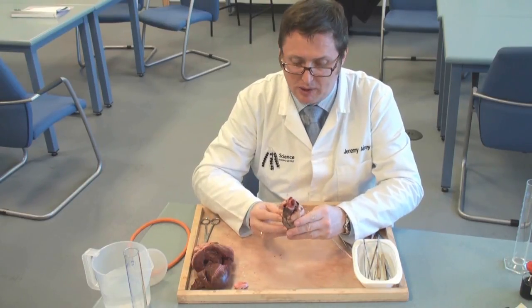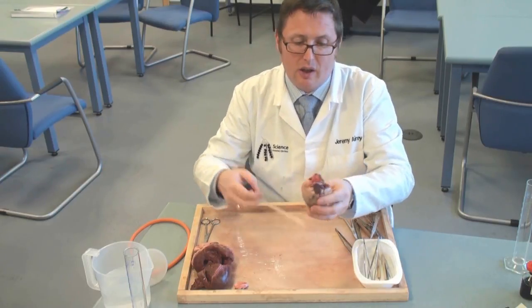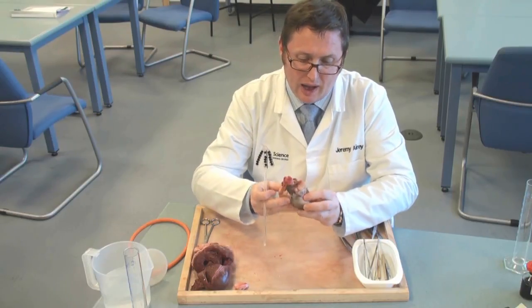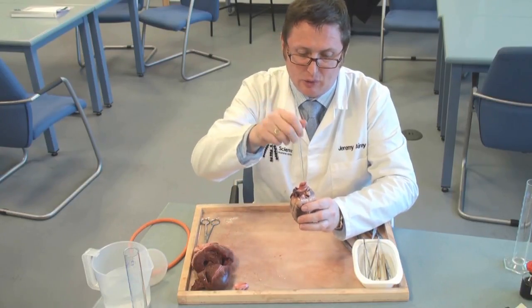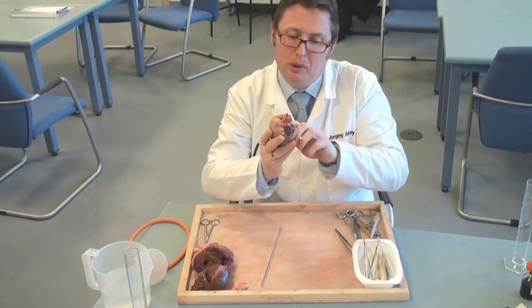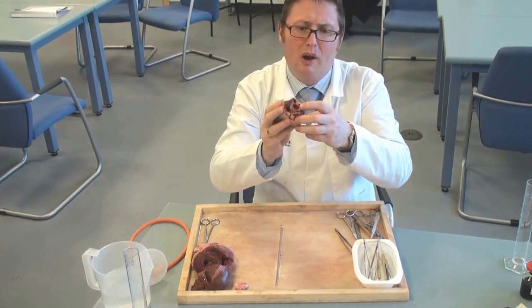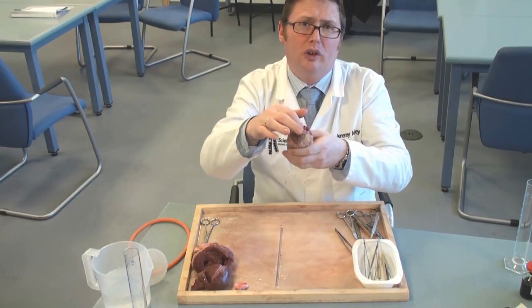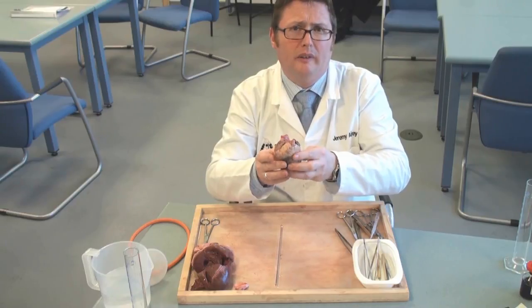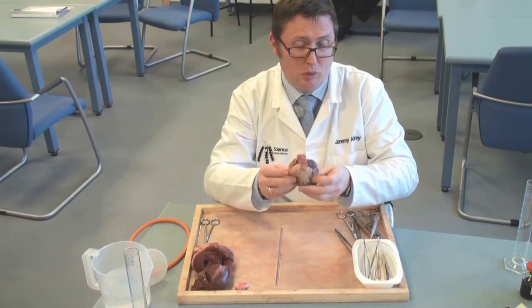One of the things you ought to be thinking about is showing how the heart's connected to the rest of the circulatory system. A glass rod is a really useful tool for dissection work, and I'm going to poke it down the various tubes to see where they go. If you look at the top end of the heart, the vessel right in the middle is the aorta, and putting a glass rod down that would take you into the left ventricle.